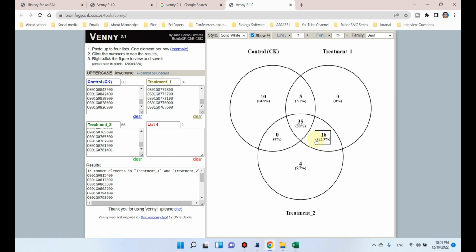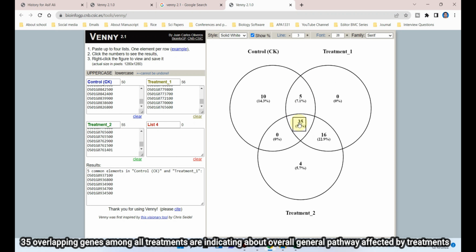So in fact, if you want to find your major genes or the candidate genes which you think will play a different role, then you should know your own story, that is, what were the differences between the control and treatments. You can try to find those genes among the common genes, mostly those which were common between all.